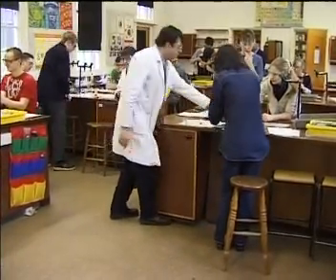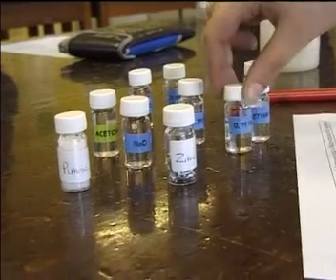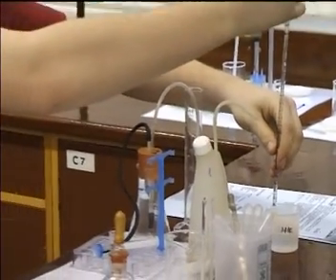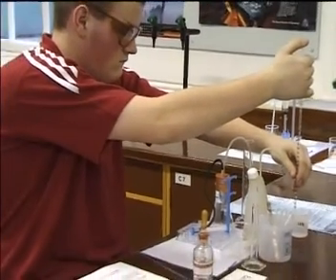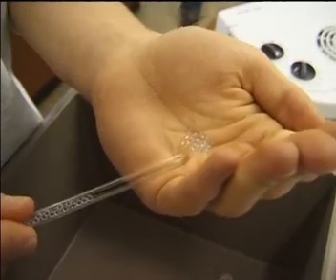Choosing microscale reduces costs, both to the school and to the environment. It's very economical. We only use small quantities of chemicals, and if there's a breakage, it's only a small breakage and we don't have to spend so much money to replace it. Since we've started microscience, we used to do it on a large scale. We used to chuck litres of acid down the sink, and now we have a small bottle on each bench. What would take about 25 cm³ of acid now takes 2. So you can see the saving on acid, marble chips, things like that.